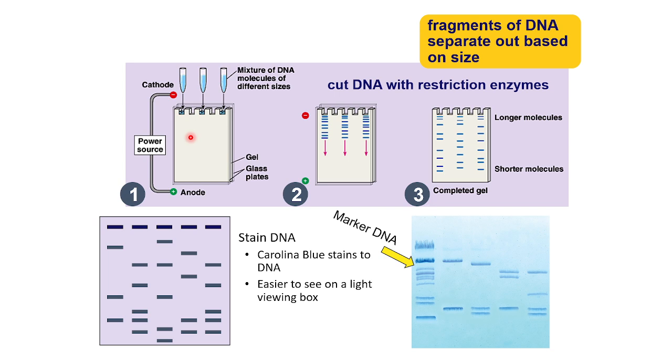For example, you have 100 base pair, 200 base pair, 500 base pair, 1000 base pair, and so you prepare DNA of that particular length, because you are synthesizing a DNA. So you can make it up to 100, 200, 500. You make this DNA, put it in a particular vial, give it a color, and you run it.